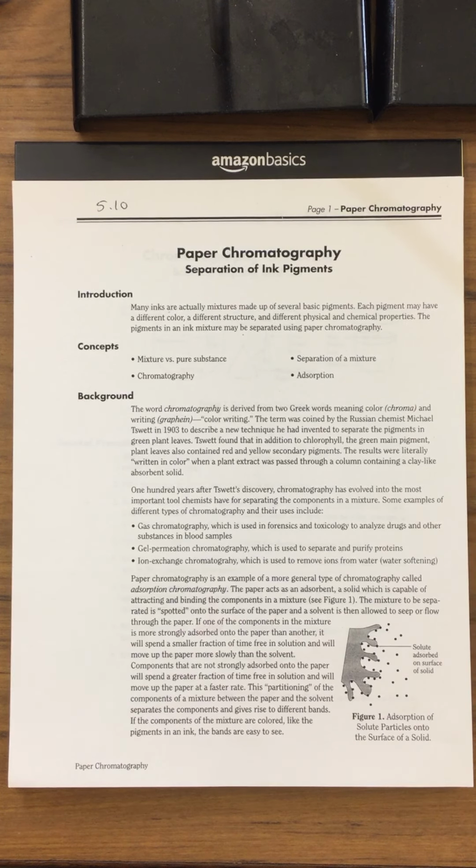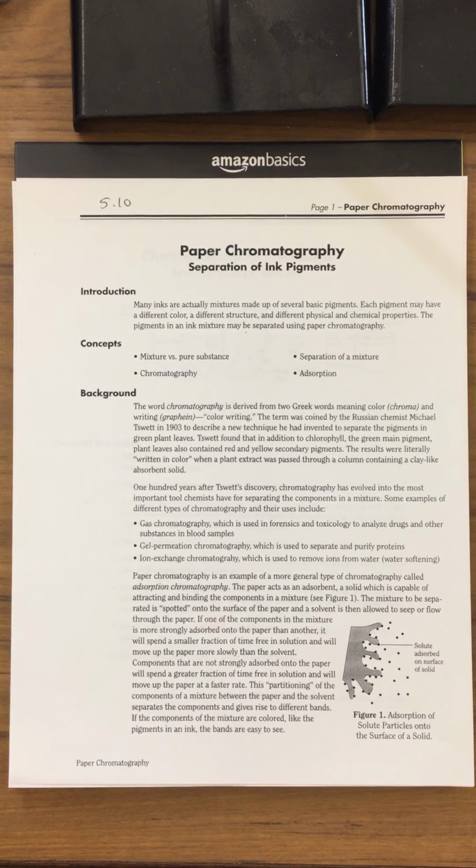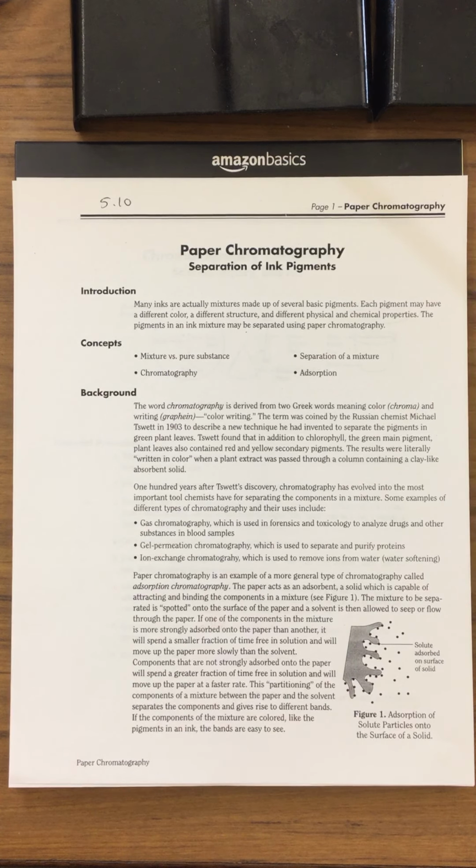This is going to be the lab on paper chromatography, and we're going to read a little bit of this information in this paragraph, and then I'm going to go ahead and do a time-lapse video of the actual procedure, and then we'll have a summary of our results. So I want to point out a few things, and that's in this first paragraph.